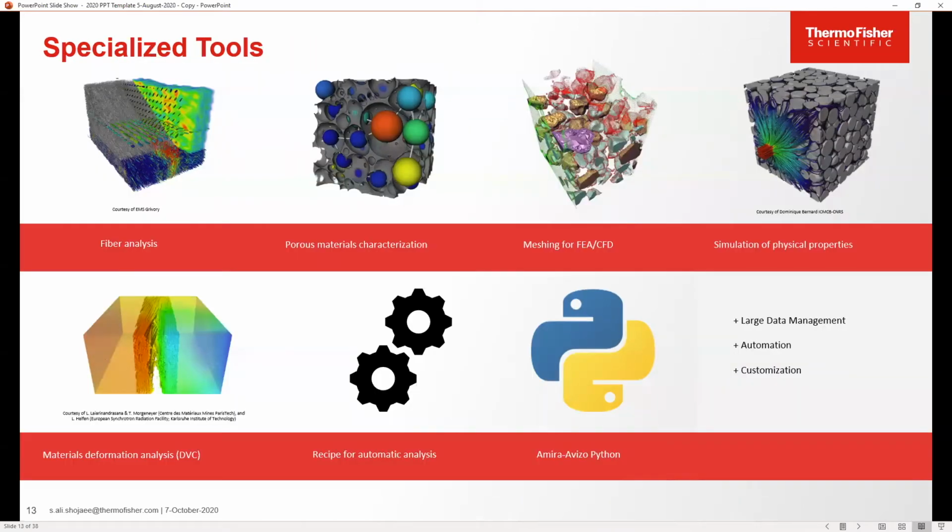So this is the process that you go through anytime you want to work with a data set. You bring in your data, you visualize it, you denoise it, you segment it, you quantify it, and then you add. But on top of this general process, there are specific applications that might require some additional resources or tools to help get the best result possible. We're going to go through these and then talk about other things that you can do with the software on top of performing your general image processing.